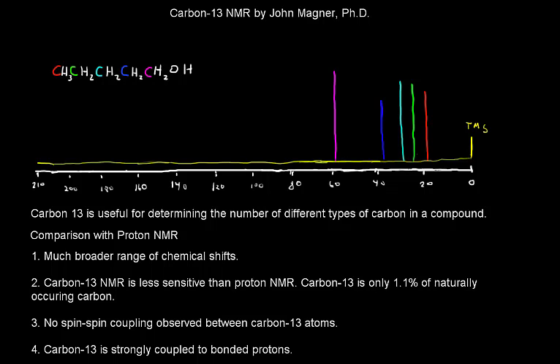This video presents the use of carbon-13 NMR for the determination of molecular structure and contrasts carbon-13 NMR to proton NMR. So if you haven't already watched the videos on NMR theory and proton NMR, you should probably watch those before you continue with this one.